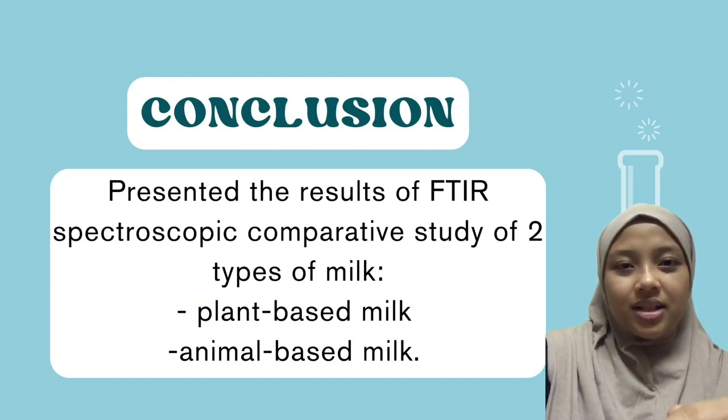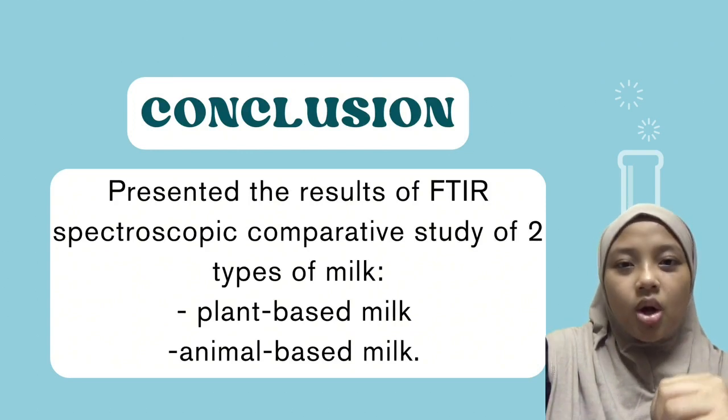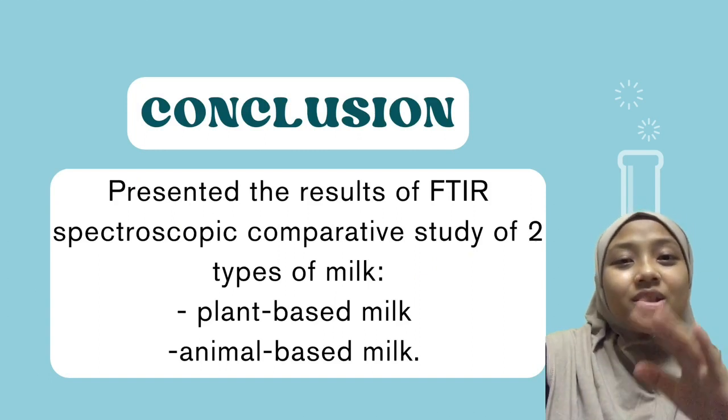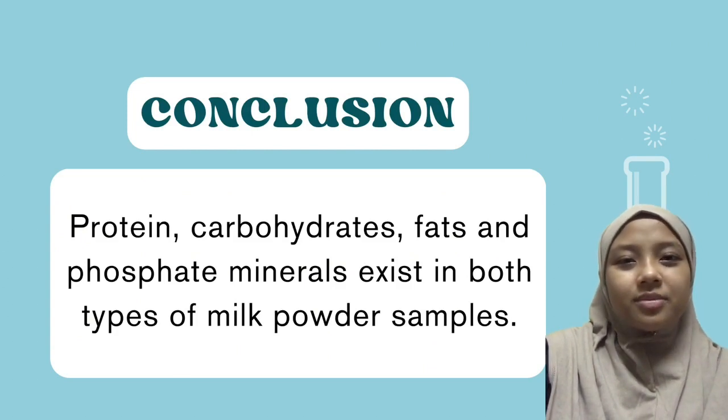We also get to study the chemical composition and FTIR spectra of four milk powder samples, of each peak to know its functional group. This confirmed that protein, carbs, fats and phosphate minerals exist in both types of milk powder samples.